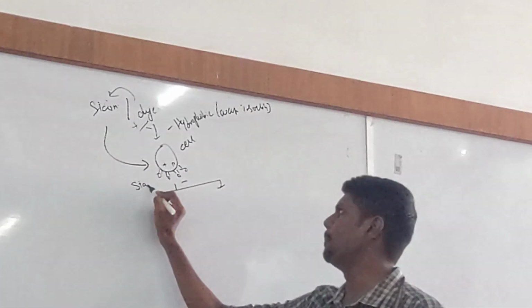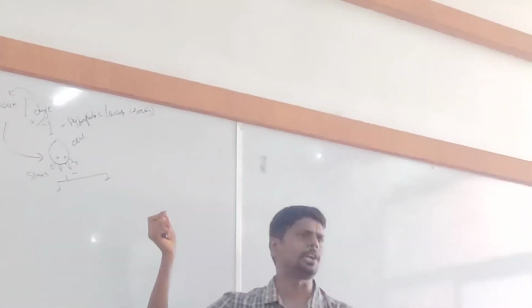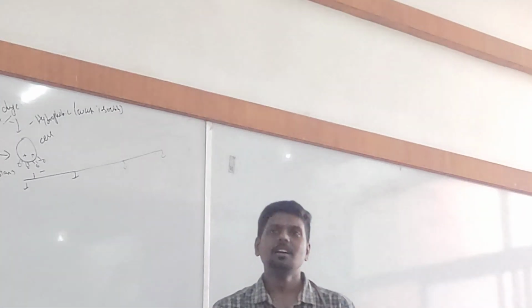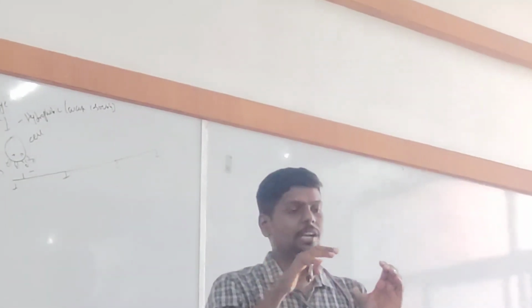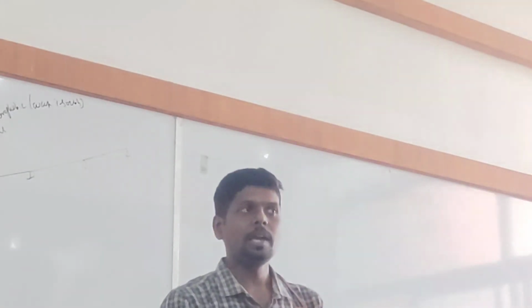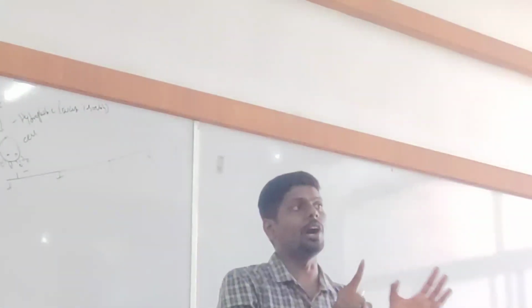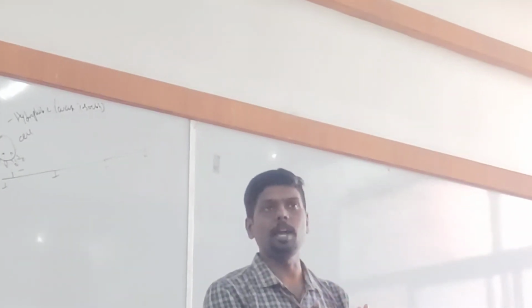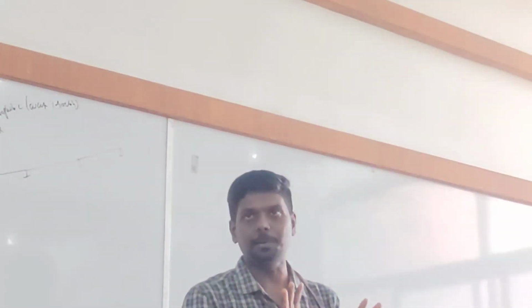Now I am going to tell about various types of stains. I am giving you a classification of stains. A very simple classification, not much depth. If we want a stain that will colorize a living cell without killing the cell, say I have an amoeba and I stained the amoeba. Upon taking color, the amoeba should not die, it should be alive, because I want to study the motility of the amoeba, its movement. That means I don't want to kill the amoeba.